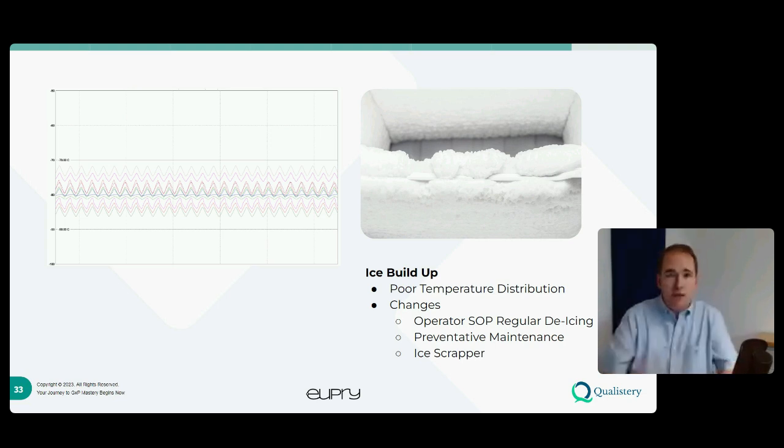Well, it really comes down to criticality. How critical are the products that you're storing within it? That's why that risk assessment at the front end is so important. Do you need to have 2 probes? Is it really critical? If it is, put 2 monitoring probes in there. It's going to give you a lot more information. So I would say that it really depends on what you're going to be storing within the unit.